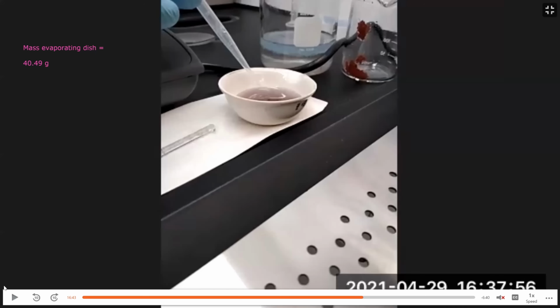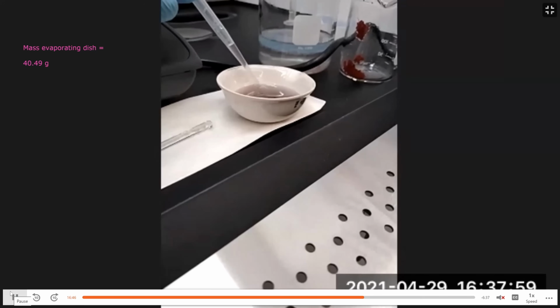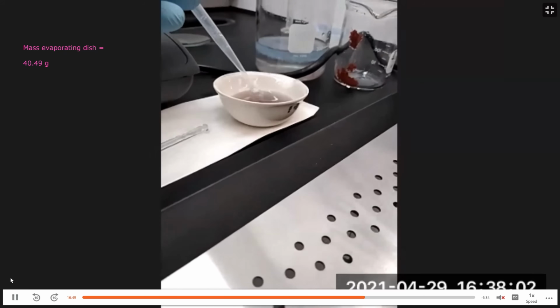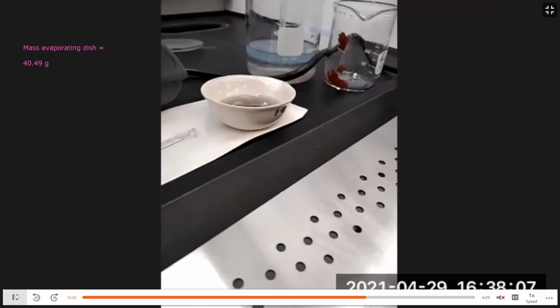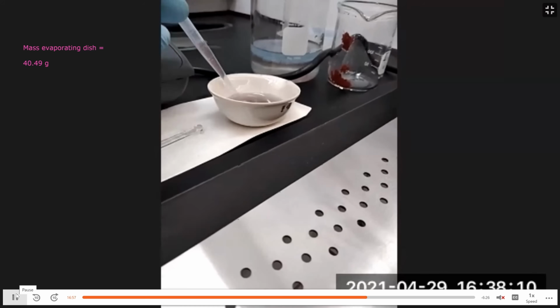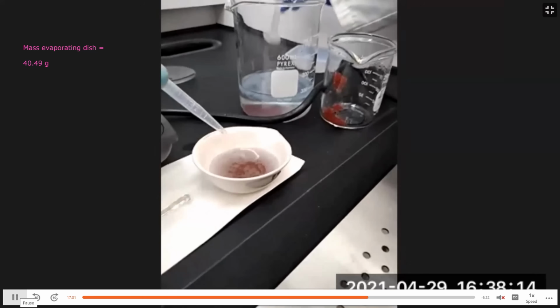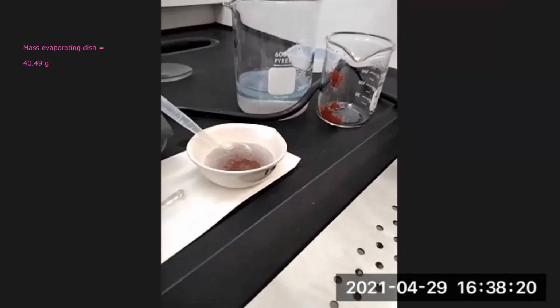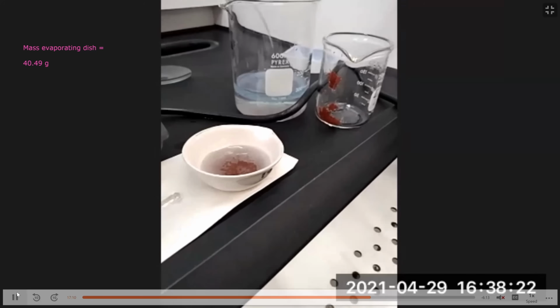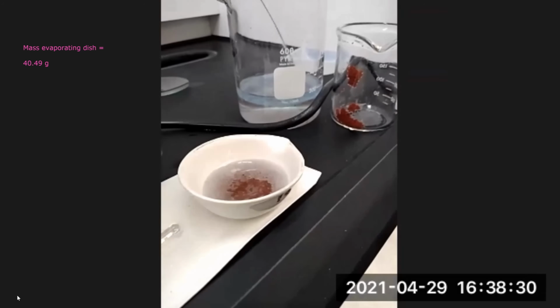Now we're going to remove the water out of the evaporating dish using a dropper. Be careful not to pick up any of the copper in the evaporating dish. This is very tedious, but it's very important that you do this carefully so as not to lose product while you're removing the solution. And we'll get the rest of the copper out of the beaker in just a moment.